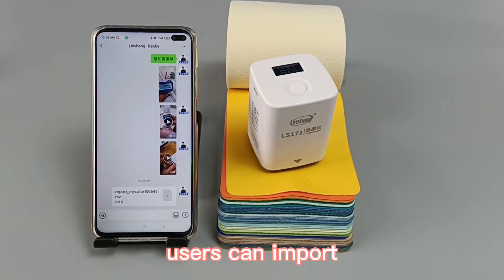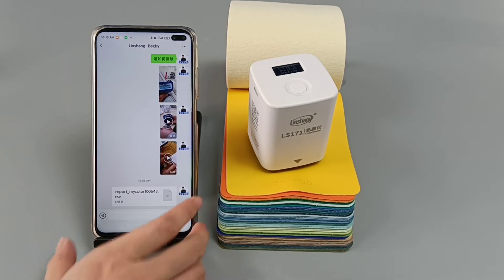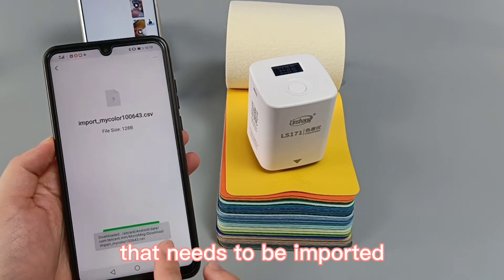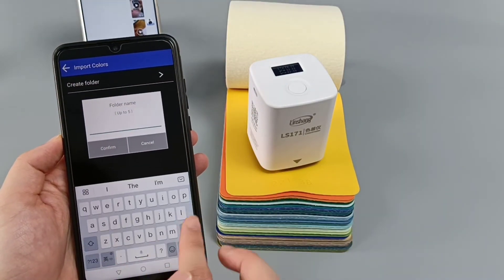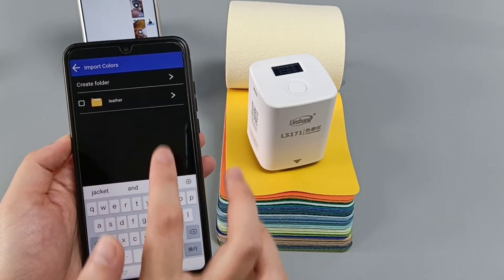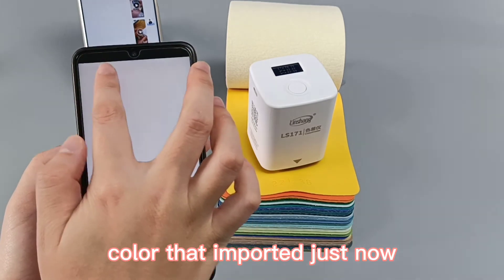Users can import colors shared by others into their own app, but they must use the same model of colorimeter. Taking WeChat share and import as an example: find the file that needs to be imported, click open, create a folder, and enter to view the color that was just imported.